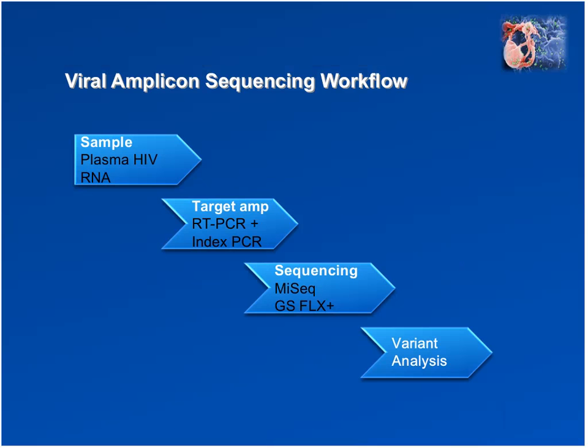So here's a summary of the amplicon sequencing workflow we use to generate our data. To begin with, HIV RNA was extracted from plasma samples. Initial amplification of the region of the HIV genome we were interested in was accomplished by RT-PCR. These RT-PCR amplicons were used as template for generating the HIV-RT amplicons that were sequenced.